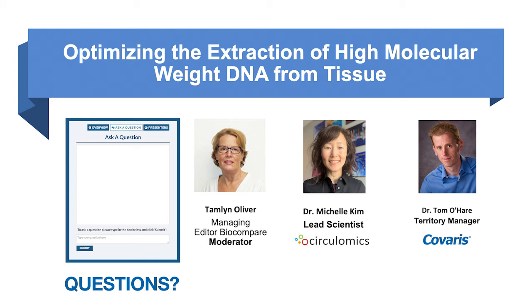Okay, Mary, I guess this one will go to you. Is the cryoPREP effective for bone samples? You can use the cryoPREP with bone samples, yes, or say tumor samples with calcifications within them.